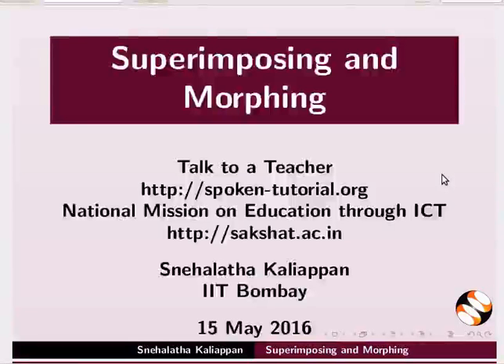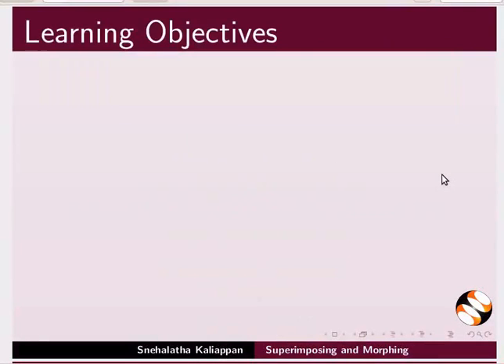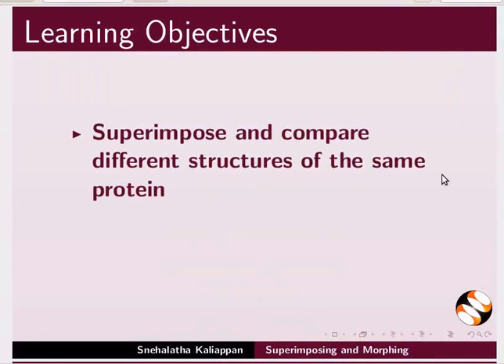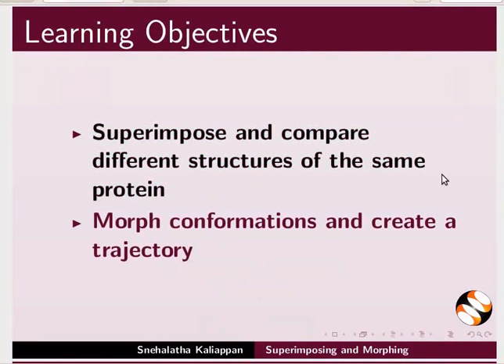Welcome to this tutorial on superimposing and morphing. In this tutorial, we will learn to superimpose and compare different structures of the same protein, morph conformations and create a trajectory.